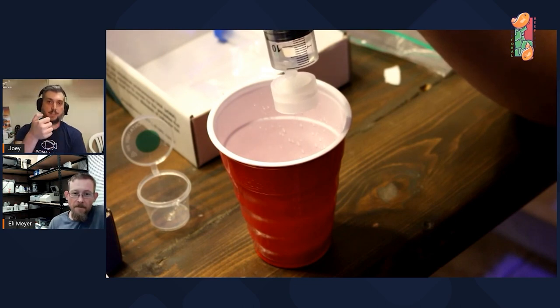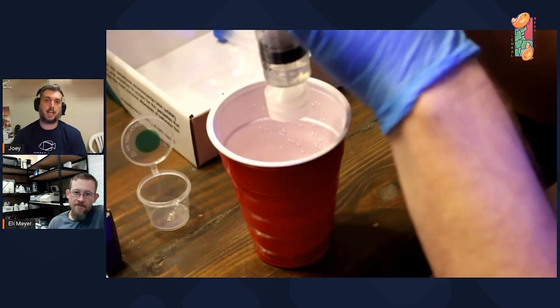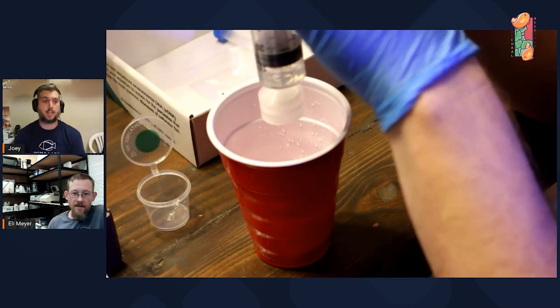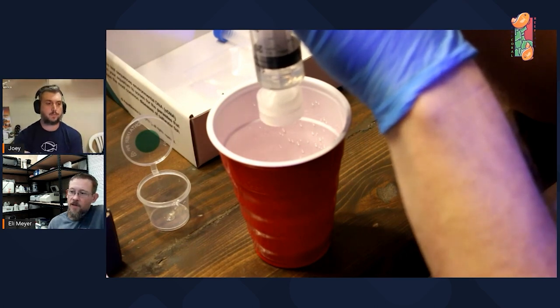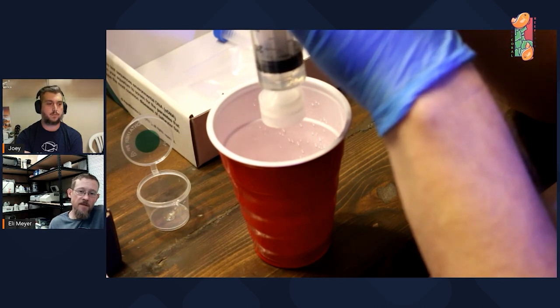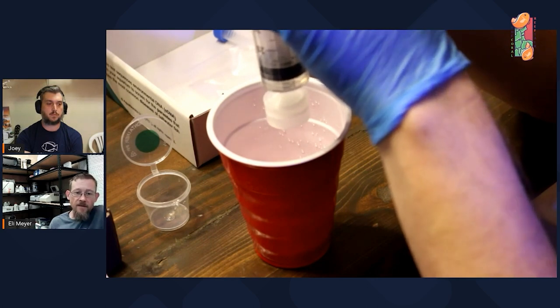When you're pushing down, there's definitely a lot of pressure getting it through that tiny opening. That DNA you're collecting is known as eDNA — environmental DNA. In the tank DNA test, most of it is dissolved DNA floating around in the water, but there are also some cells and pieces of tissue floating around. The microbiome test, in contrast, is really analyzing bacterial cells themselves.